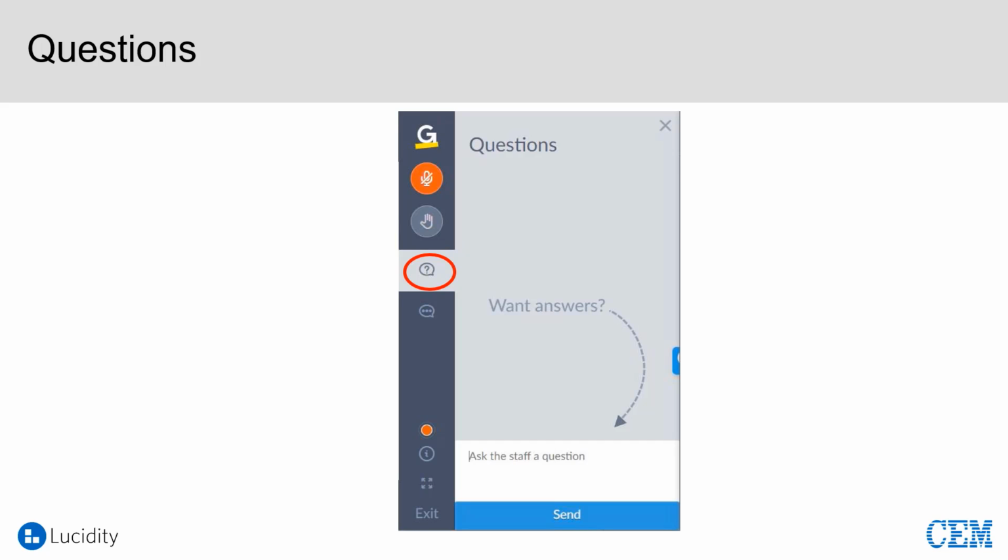We didn't touch on it quite as much today, but one of the things I mentioned a few times is just thinking about your analytical methods. When you develop an ideal gas chromatographic method, one of the things I would teach you in a course is to have as little baseline as possible. That means I'm always looking at peaks, and that I'm making my method as efficient as possible.